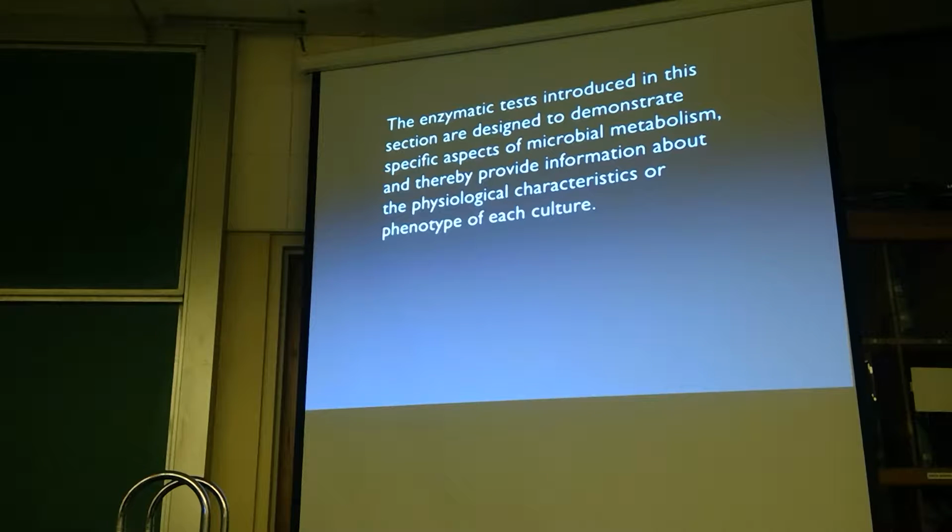So, these enzymatic tests that we're going over are designed to demonstrate specific aspects of microbial metabolism, and actually they're primarily applied to gram-negative fermentative organisms. However, some of these tests can also be applied to other organism types, so they will have some application to your semester project when you get to that point. So some of you may have organisms you can think about: what kind of tests am I going to need to do for the semester project organisms? Well, as we go through these, I'll point out some that you can.